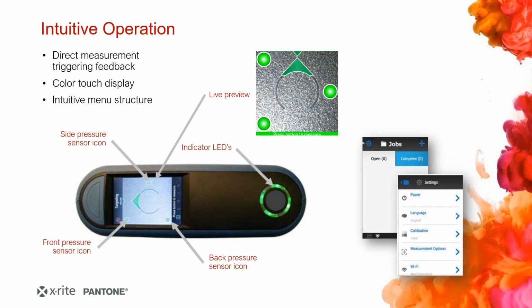We changed the design so that there is no more user influence within the measurement. We have two contact points in the in-plane direction and one contact point in the out-of-plane direction in order to minimize tilt. So there is a really new design, and it won't affect the user anymore. We also have one new feature. You can take a live preview of what you measure to avoid measuring scratches, like you see here in the snippet window. So you have full control over what you measure.